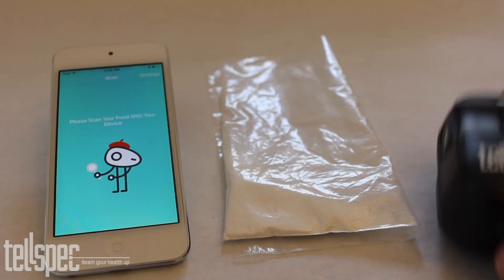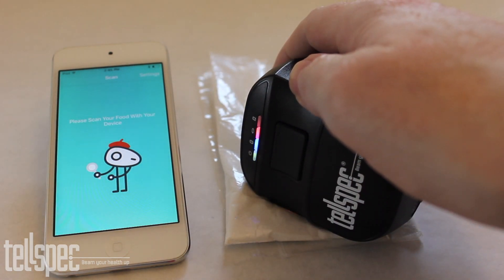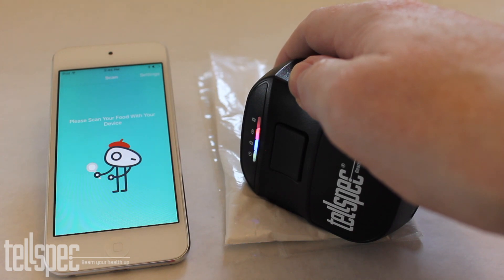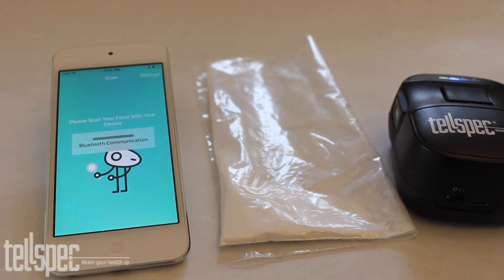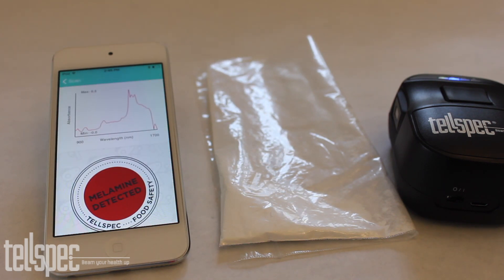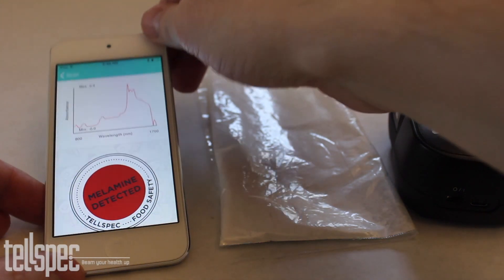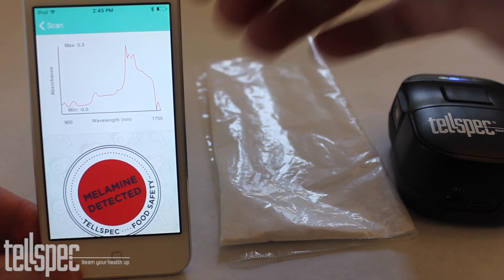Now let's repeat the process using some contaminated baby food. A scan is taken and the information is sent across to the phone, up to the cloud where it is analysed. A determination is made that this is contaminated baby food. You can clearly see the spectrum that shows that this has melamine in it.